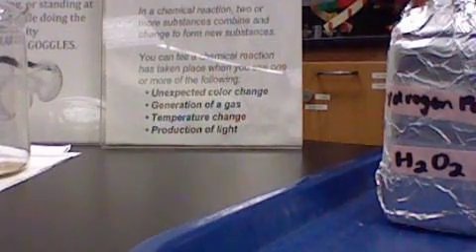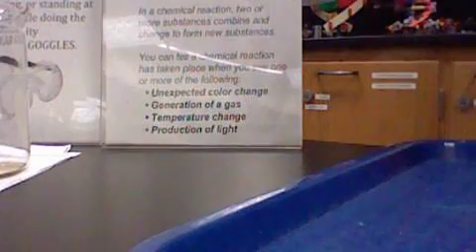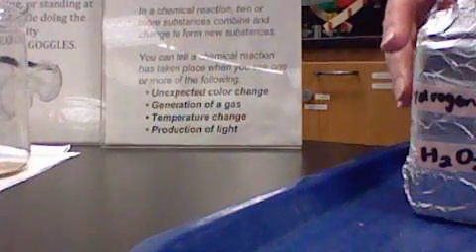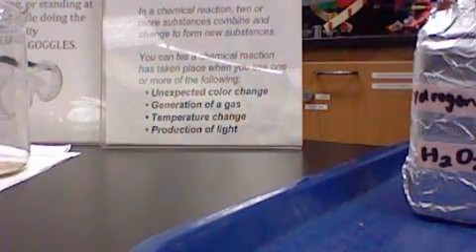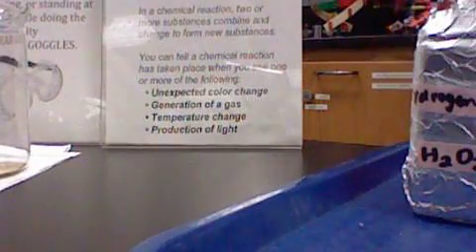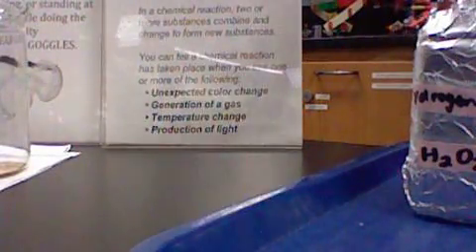All right, so we have two substances here. This one is called hydrogen peroxide, and this one is called luminol. Okay? And so I need some assistance. So, yep, I'm going to have you and you start. All right, calm down.